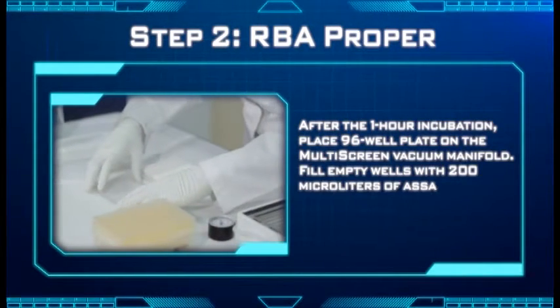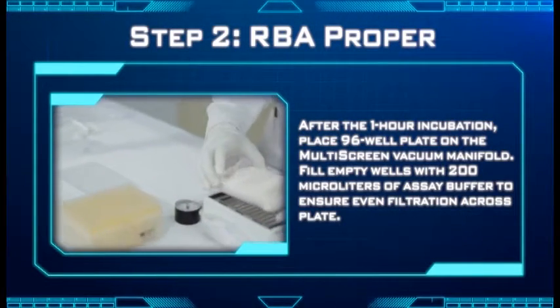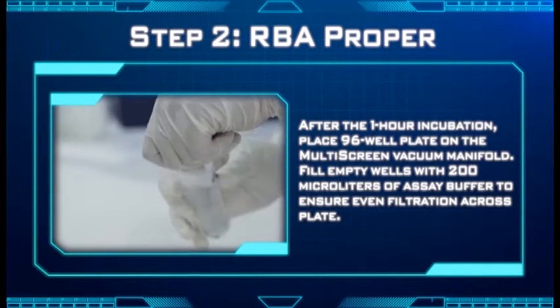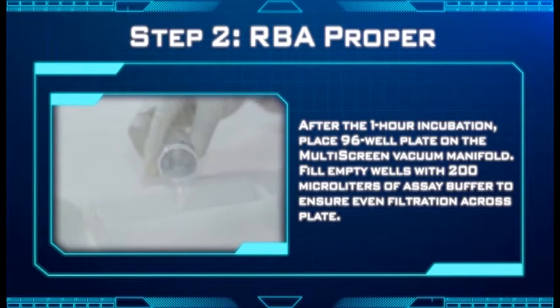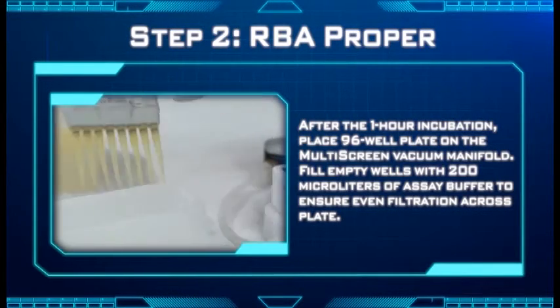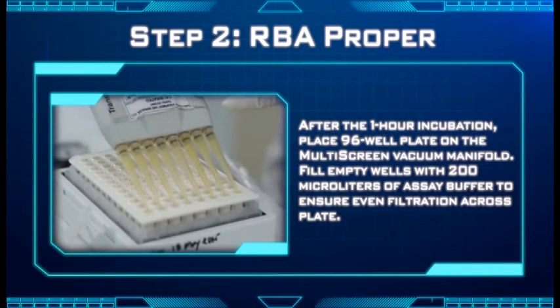After the 1 hour incubation, place the 96-well plate on the multi-screen vacuum manifold. Fill empty wells with 200 microliters of assay buffer to ensure even filtration across the plate.